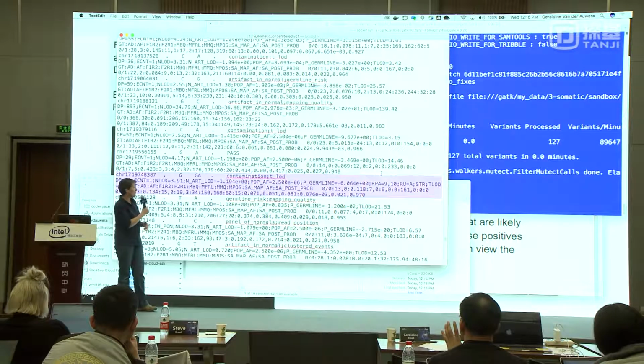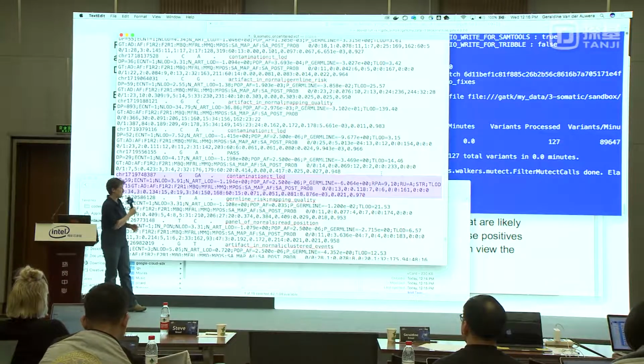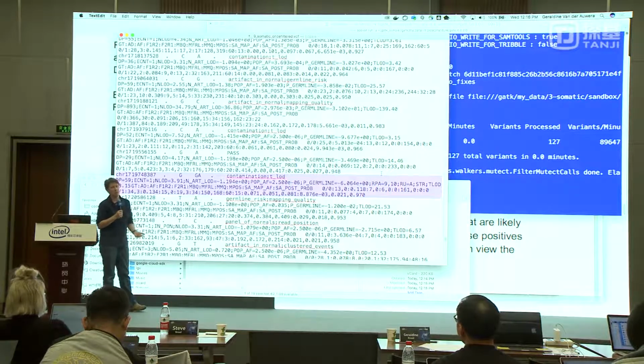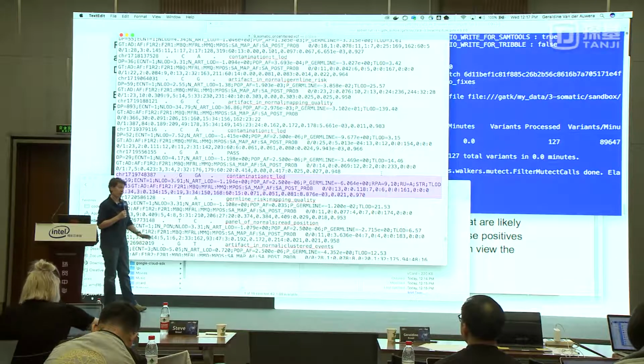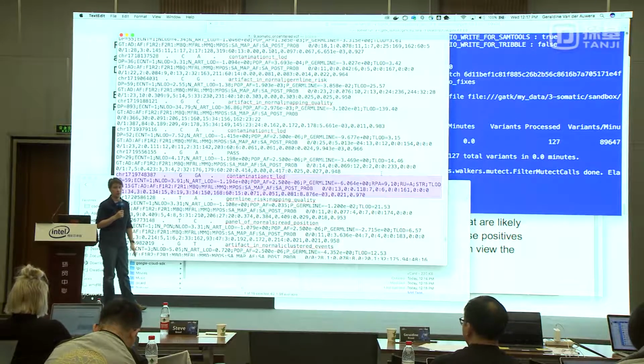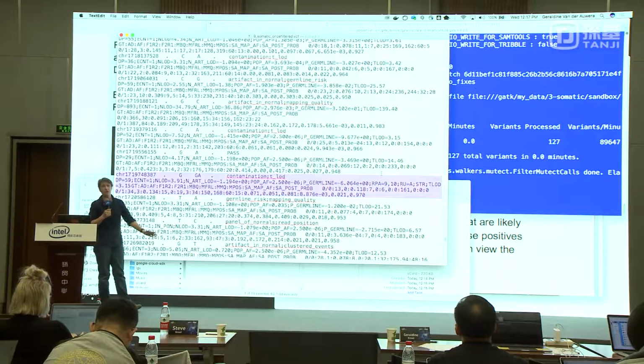It fell below our threshold, because when we applied a contamination filter, we decided that its allele frequency was too low compared to the level of contamination that we have. Our level of contamination is basically acting as a lower bound of the frequency that we can consider reasonable to detect. If I have a 2% contamination rate, that means anything up to 2% could equally be a real variant, or it could be a contaminant. So I'm going to have to disregard that.